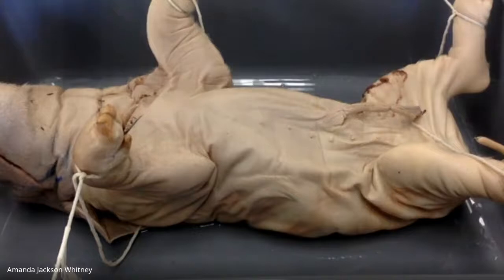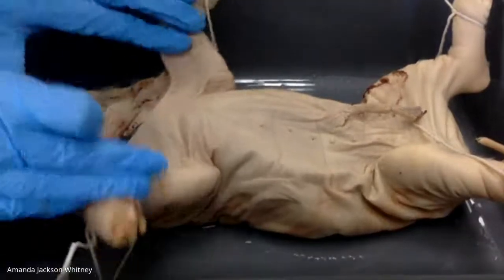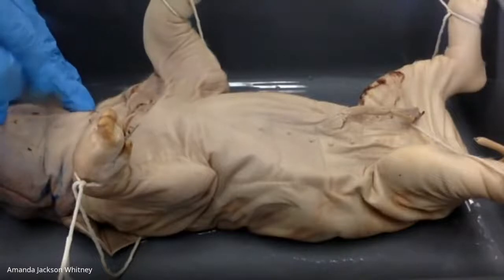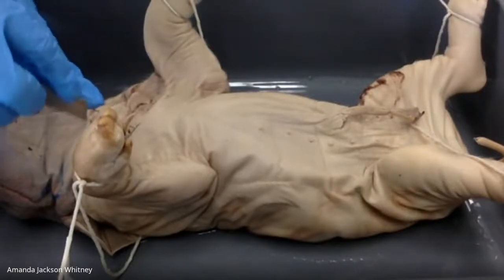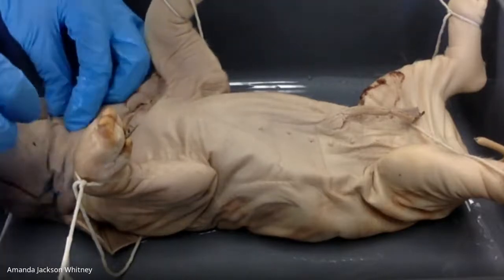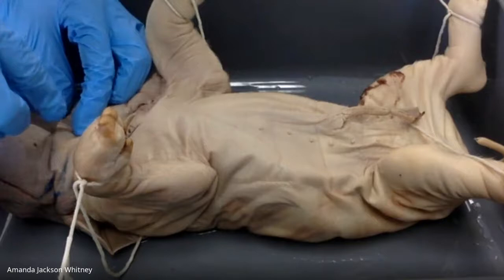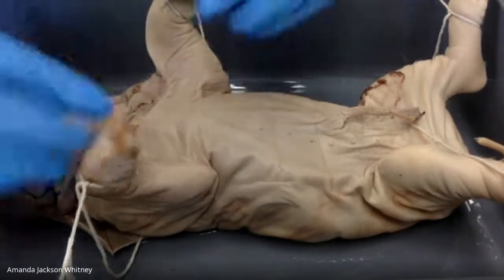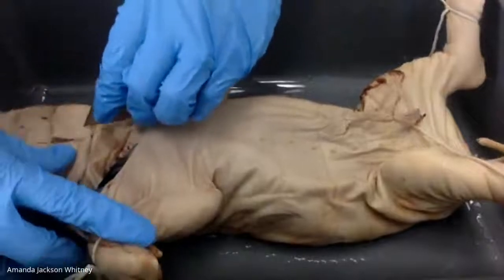So I'm actually going to start up here in the larynx region, and then I'm going to kind of work my way down. And I'm going to start cutting kind of gently. I'm going to try and go from a different angle so you guys can see a little bit better today.